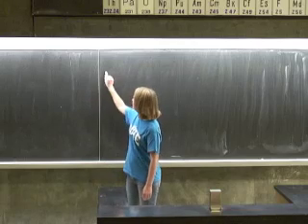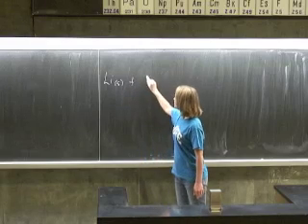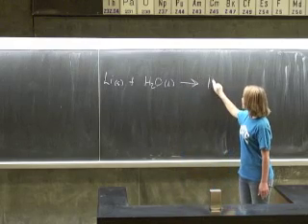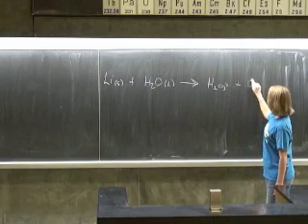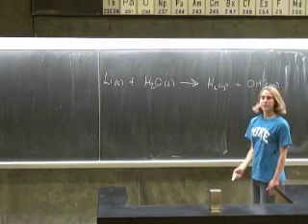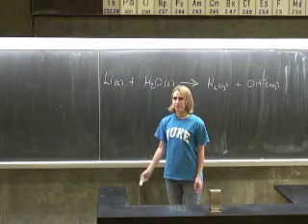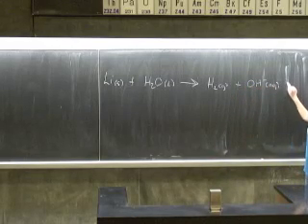We added lithium to water and produced hydrogen gas and hydroxide ions. But we still need to account for the lithium. Even though we can no longer see any of the solid metallic lithium, it has to be present in some form. What is that form? The lithium exists as lithium ions.